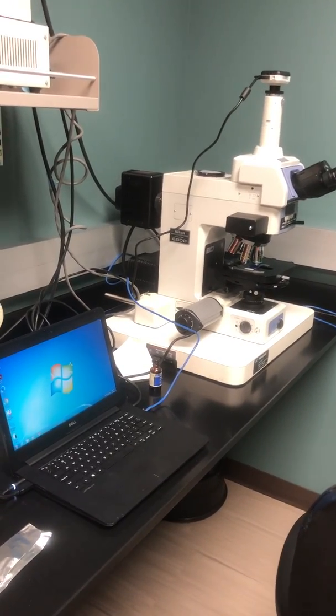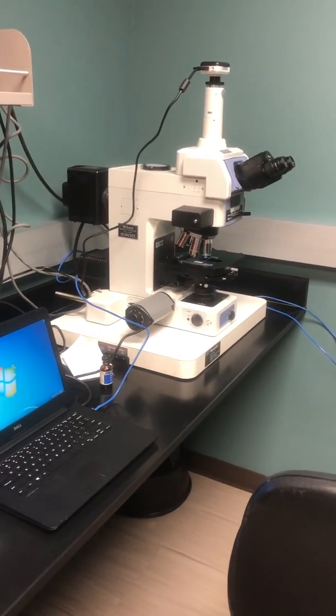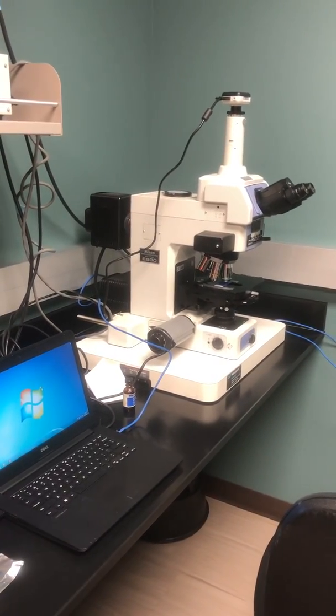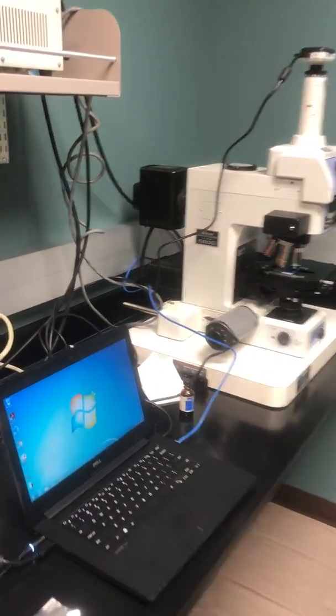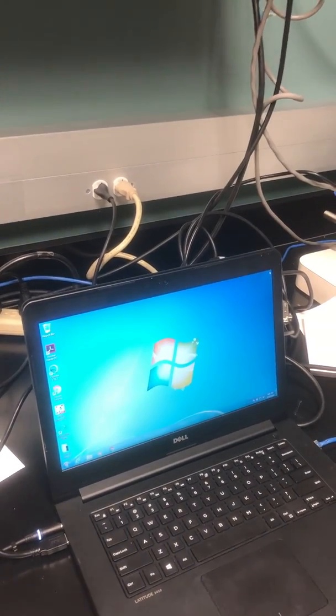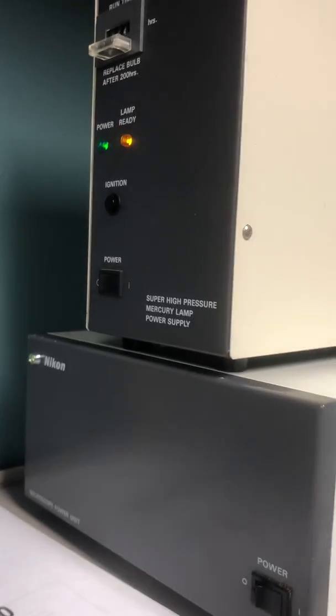I'm going to attempt to teach you how to use the fluorescence microscope and the bright light microscope to take the images of your slides. So the first thing you're going to want to do when you come in is just log into the computer, and you can just use your regular PLNU login. You're also going to want to turn on the two lamps.